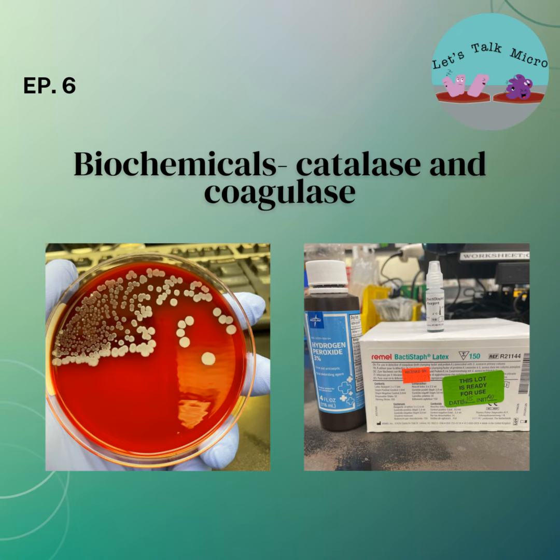So a lot of techs don't do the catalase. But as a student, get in the habit of doing all those biochemicals from the beginning. And you start with catalase. Catalase positive, you have gram-positive cocci in clusters. Catalase positive, you have a staph. If you have a catalase negative, gram-positive cocci in chains, you go towards the strep.